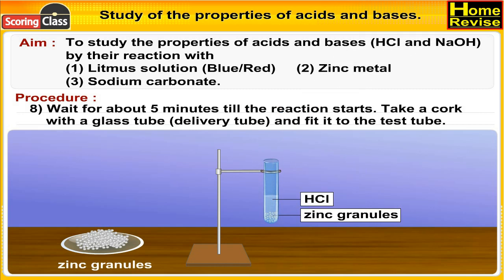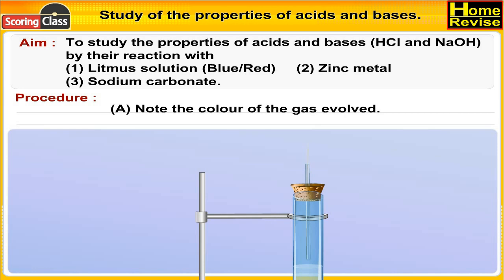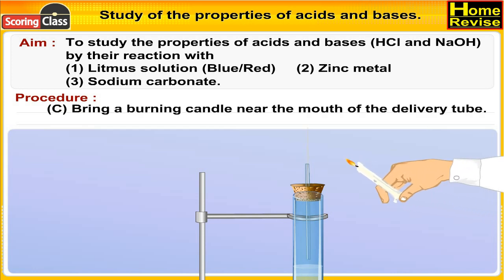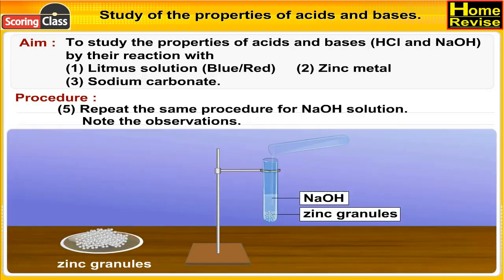Note the minutes until the reaction starts. Take a cork with a glass delivery tube and fit it to the test tube. Observe: (a) note the color of the gas evolved, (b) note the odor of the gas evolved, (c) bring a burning candle near the mouth of the delivery tube. Now repeat the same procedure for NaOH solution.